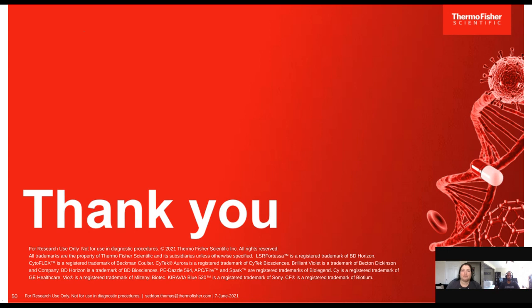So, I think in terms of PE Fire 600, you do have, again, this issue with the blue, yellow, green split. So in terms of the NovaFluors, I'm going to have to think about what wavelength that is at. But if there are NovaFluors in there, you might be able to use that 2-for-1 issue, whether that's spectral or otherwise.